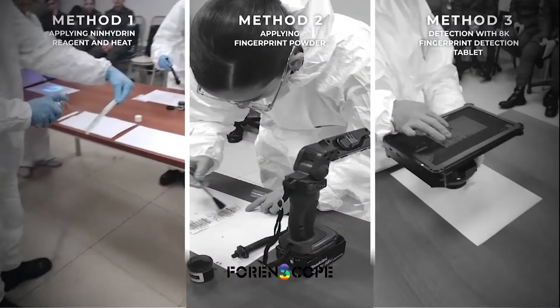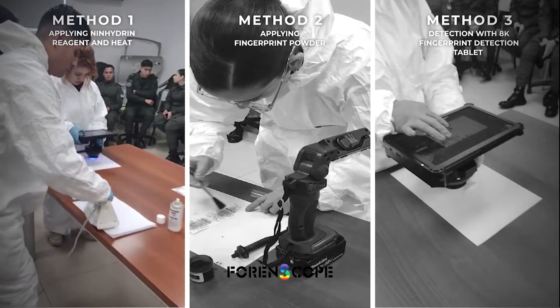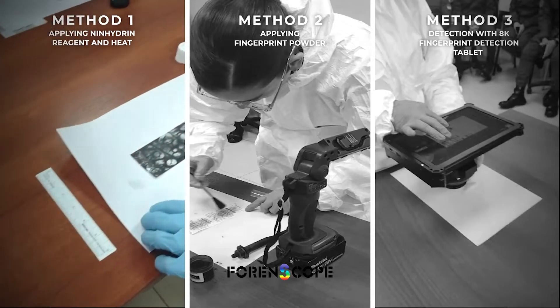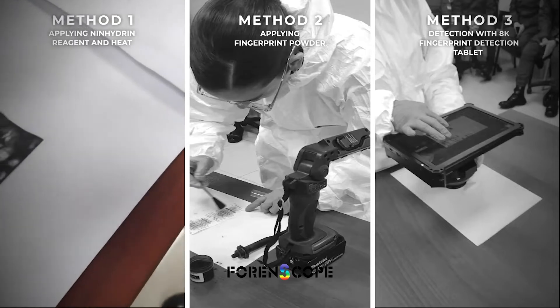Three methods for fingerprint detection. Ninhydrin is a chemical that makes fingerprint residue visible purple by reacting with the oils and fats present in them. Despite being effective even on old prints, its development tends to fade over time. Here, the process was accelerated using heat and humidity.